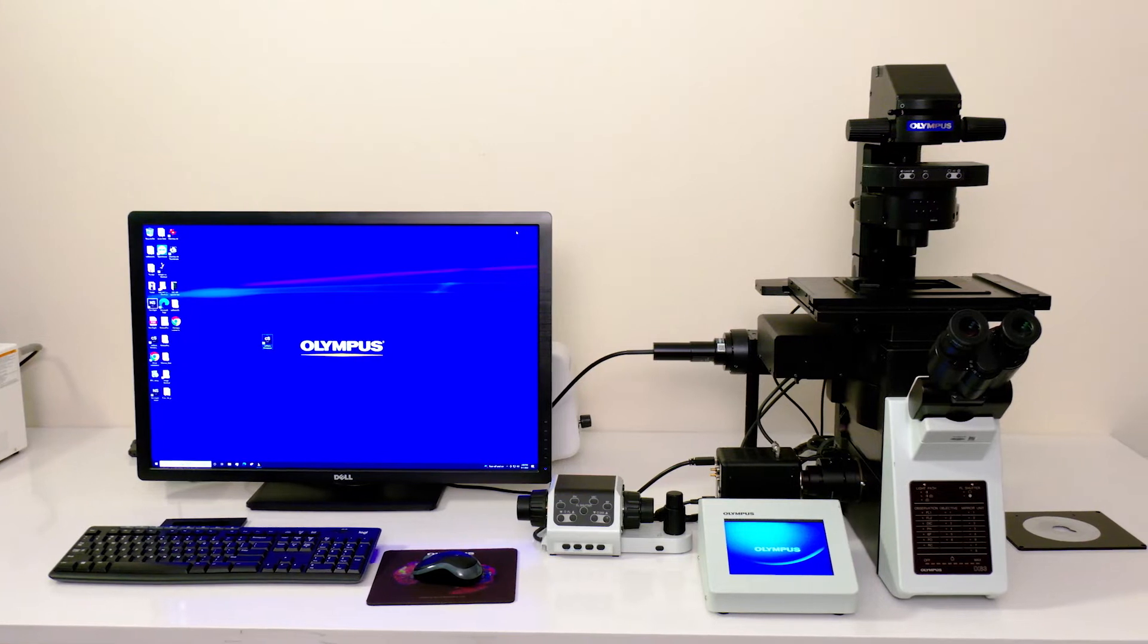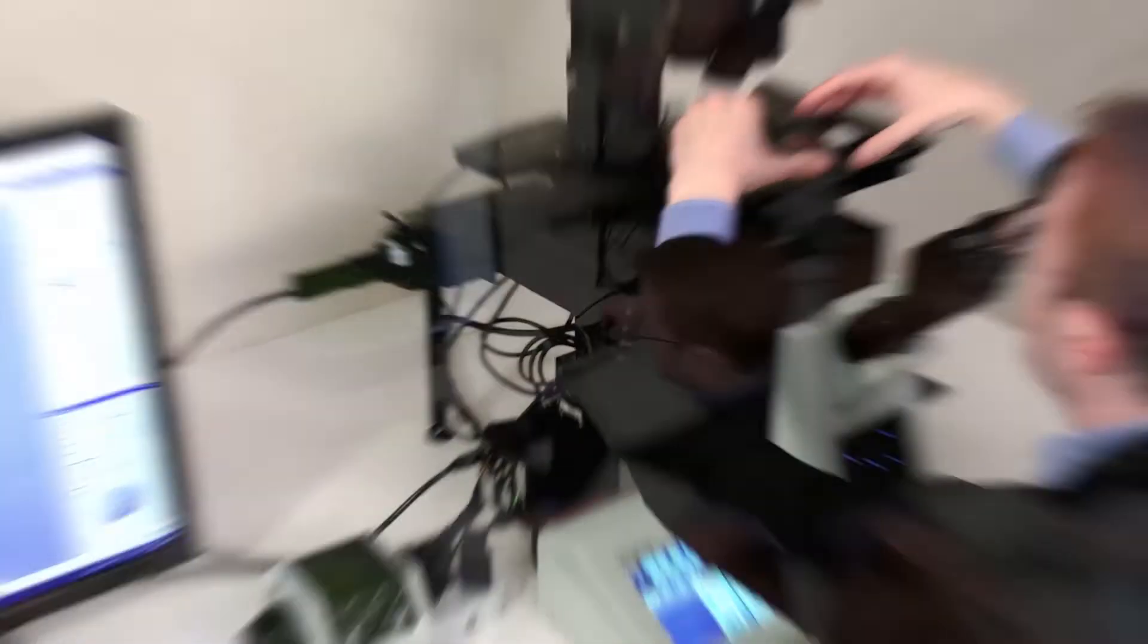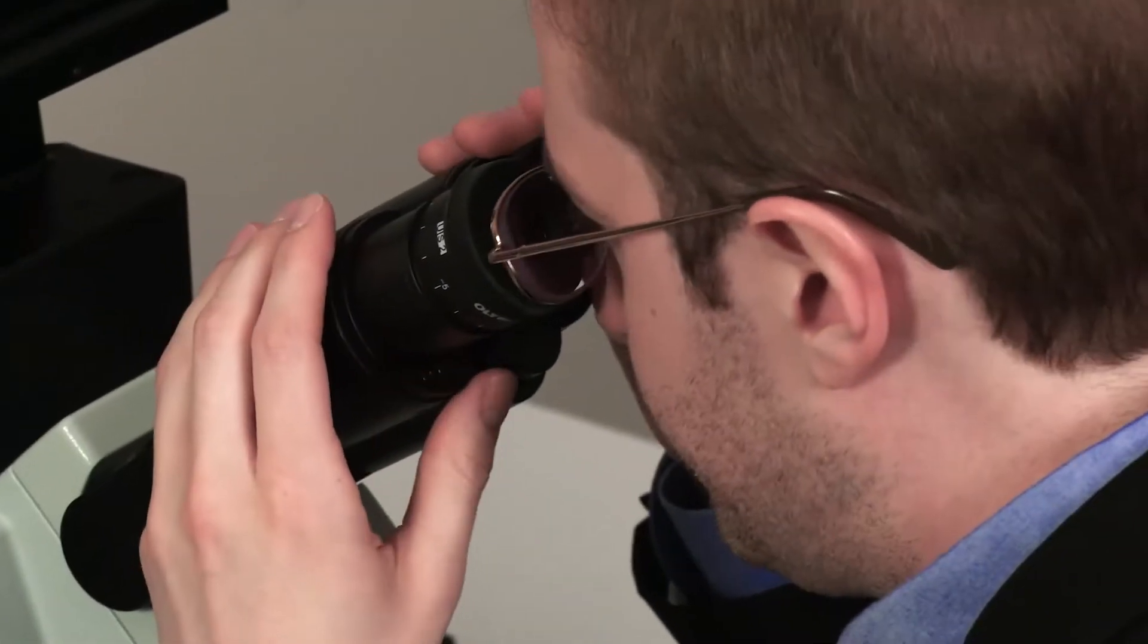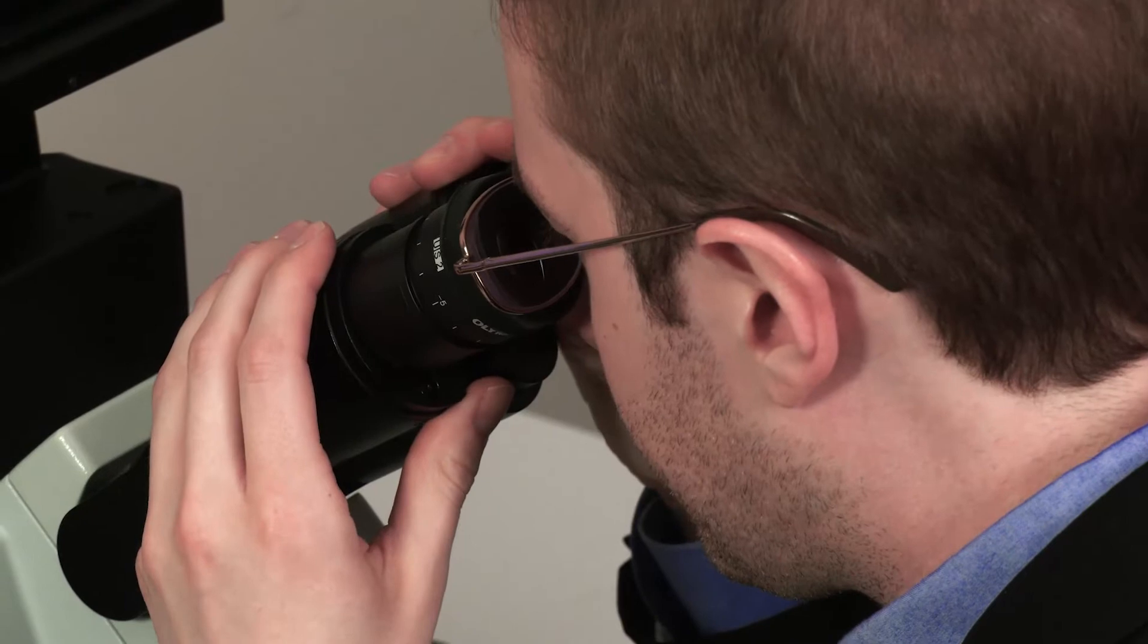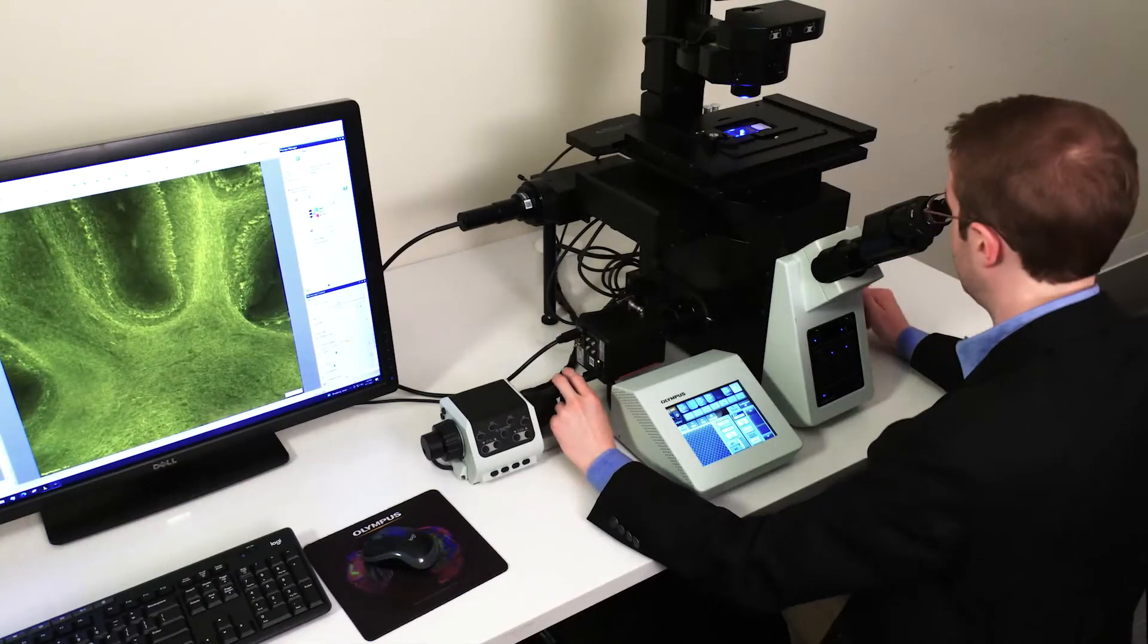Conventional inverted microscopes require multiple adjustments to set, center, illuminate, and focus on your sample before imaging can begin.